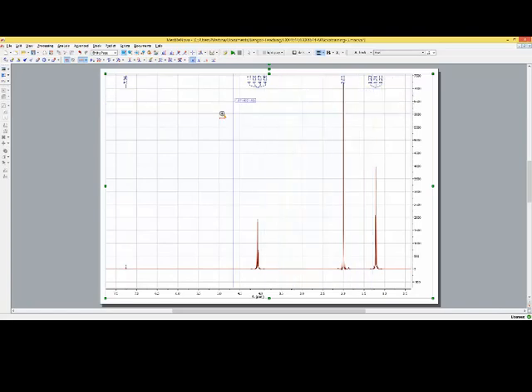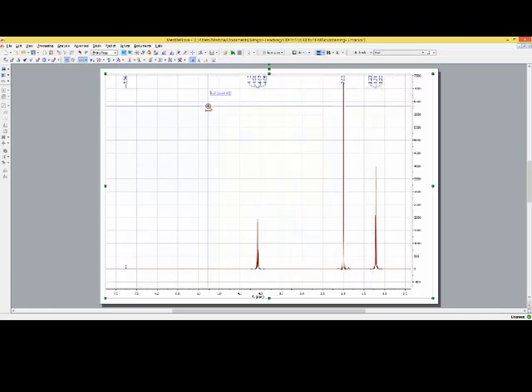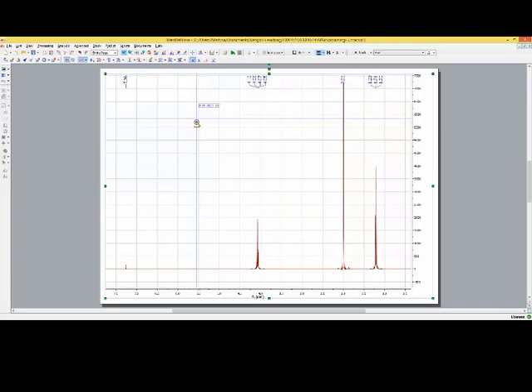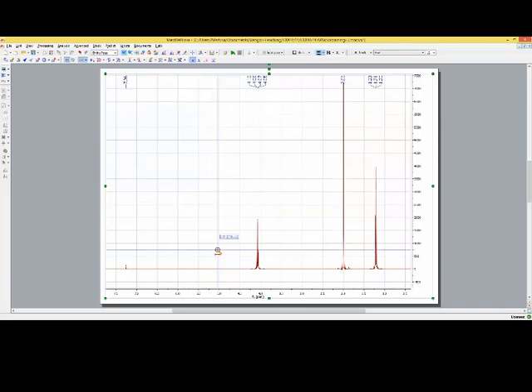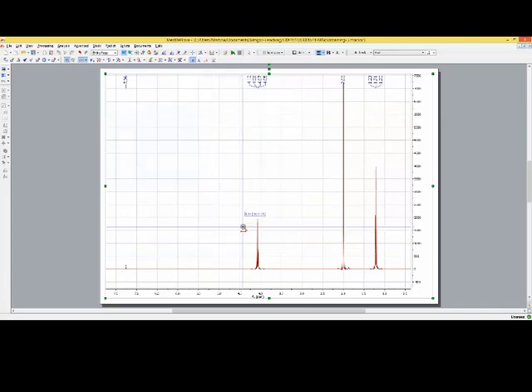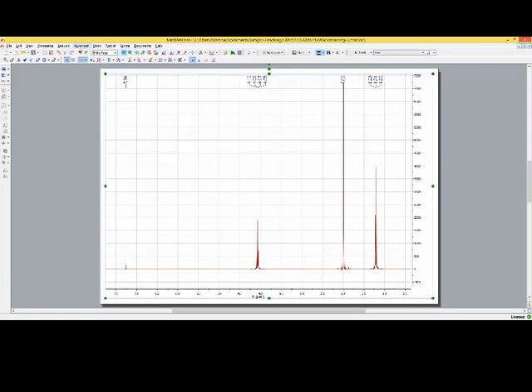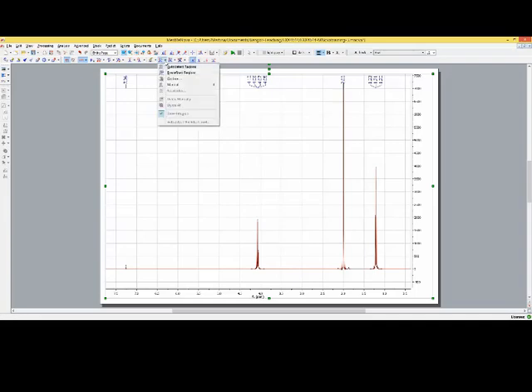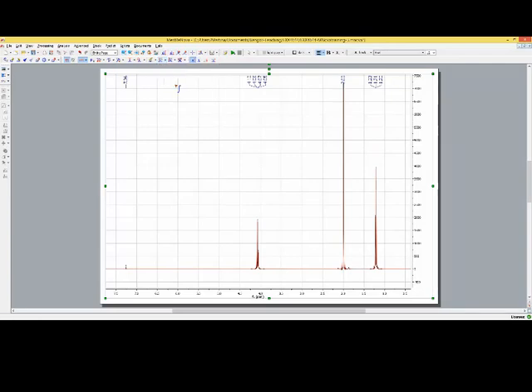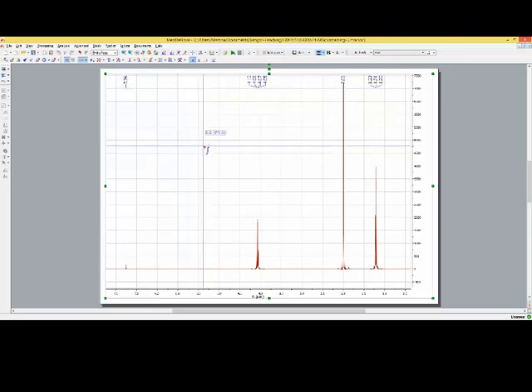The next thing we want to do is to do the integration. How do we do this? We go again for analysis or we select the integration tool from the icon bar. Again we have to make sure that we not use the automatic routine. We need the manual routine.